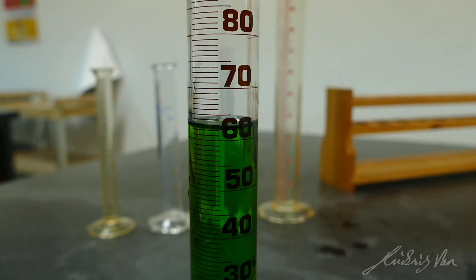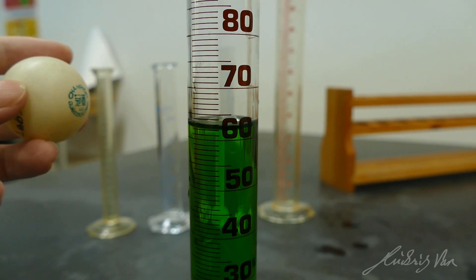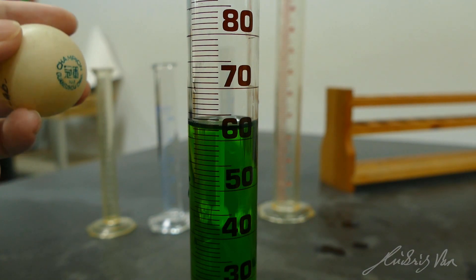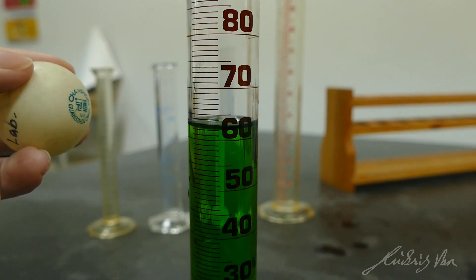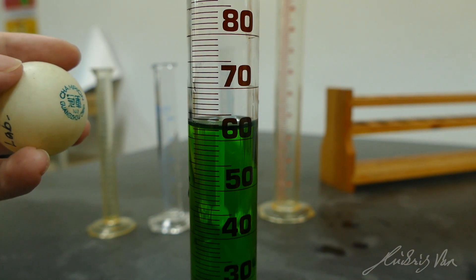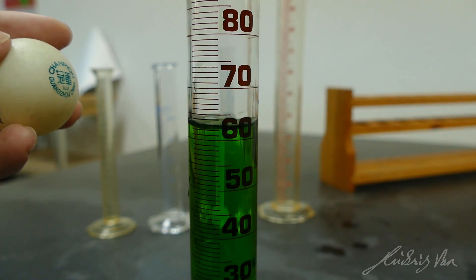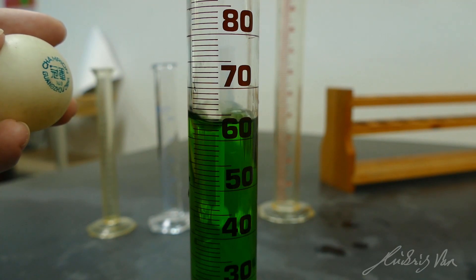So let's say I want to fill it up to 65 ml. I will need to read the measuring cylinder at eye level. Now I have a ping-pong ball down here — guess what it's supposed to represent. Yeah, your eyeball. So you have to read it at eye level. The ping-pong ball should be at the 65 ml mark.